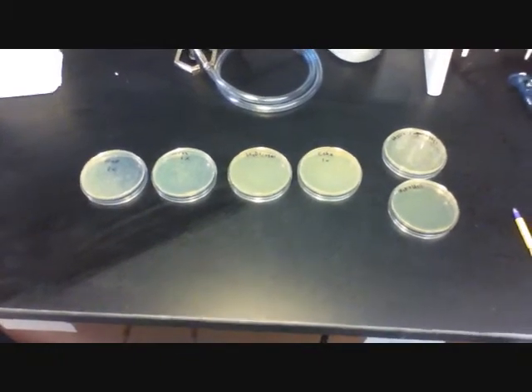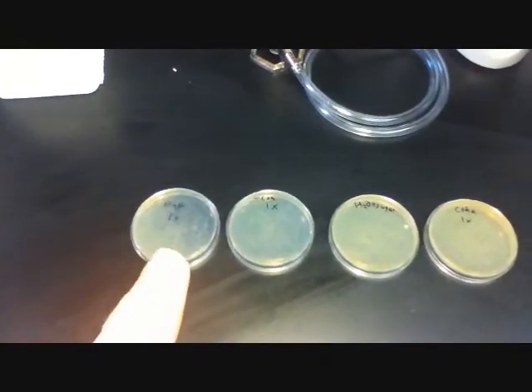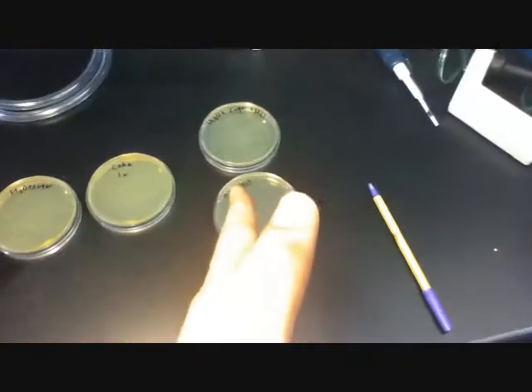Now, what you've all been waiting for, the results. The plates are lined up left to right, most bacteria grown to least bacteria grown, or in this case killed.